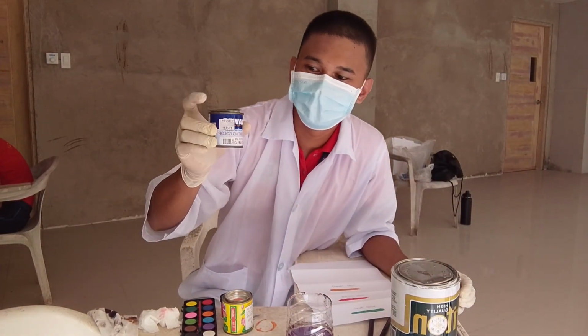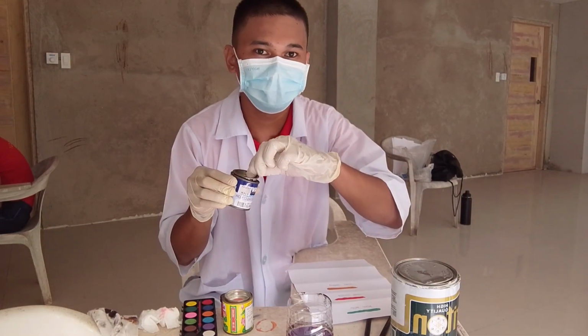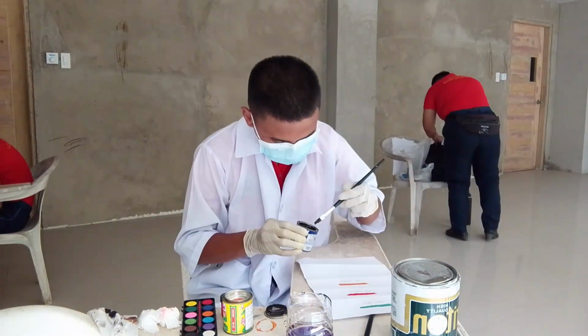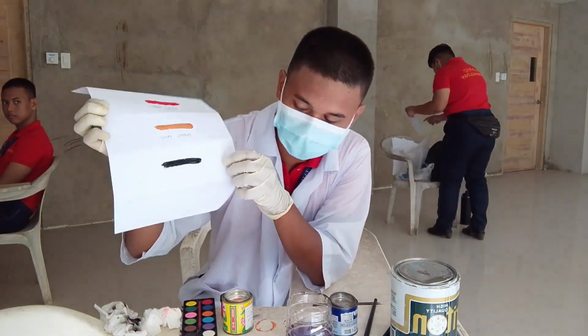So for the oil paint, it is a type of paint that is used for old and traditional paintings. So I am going to collect a sample of this. I am done collecting the oil paint.